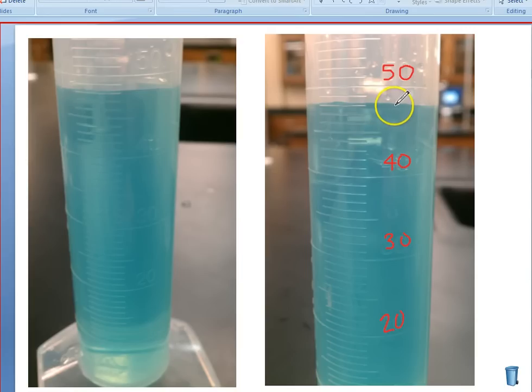milliliters. Remember when you're looking at this that you read at the bottom of this curve, this little bubble that you see. You read at the bottom of it. So it's actually slightly below 48. So I'm going to say I have 47.9 milliliters. When you look at it, you might estimate 48.0, but it's pretty close there. And remember that this last digit is always an estimate.